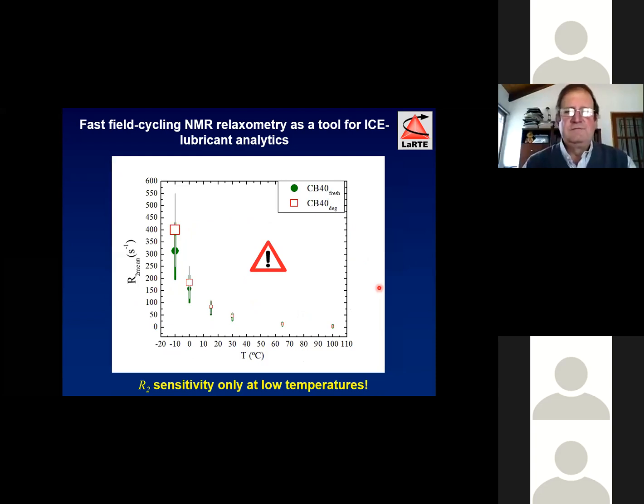And this is the important point I want to show you here. Here we compare the base, the fresh and the degraded base. Okay, you see that at higher temperatures, only started at room temperature and lower temperature, T2 or R2 start to have some sensitivity to the degradation.